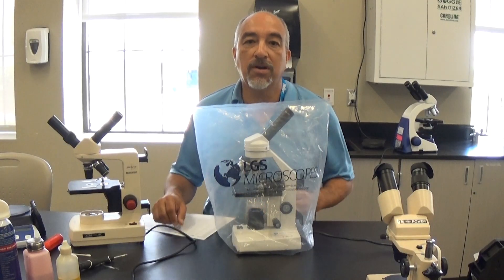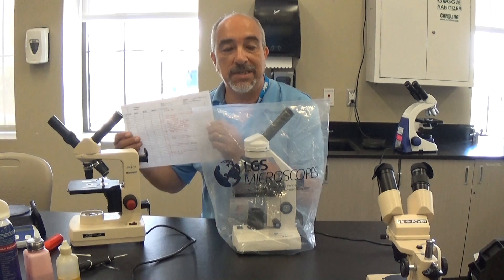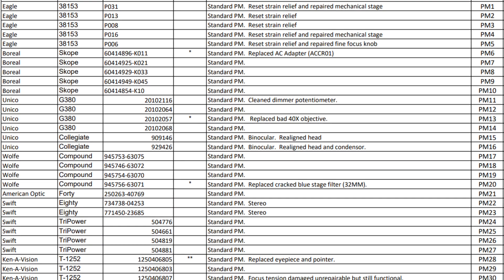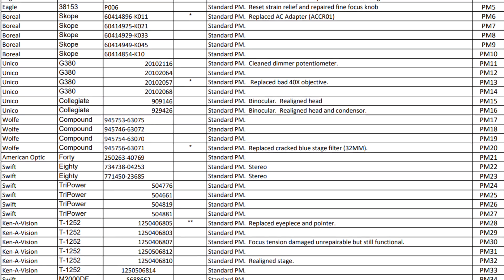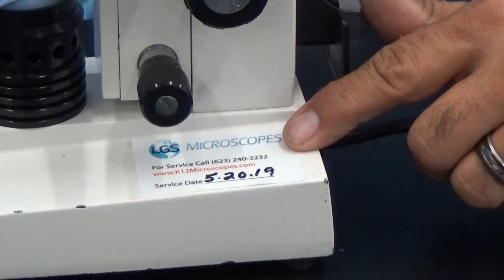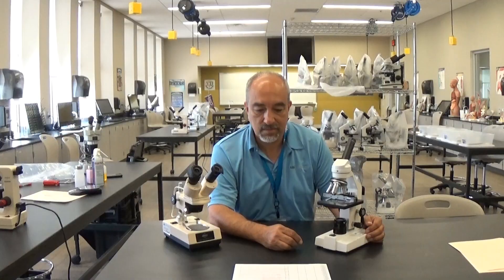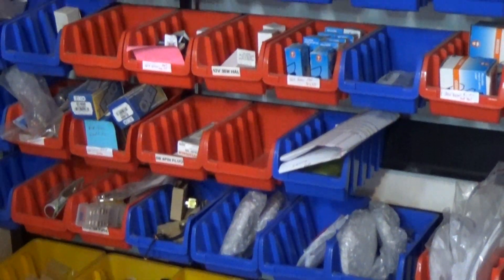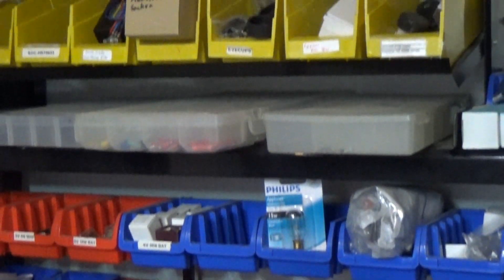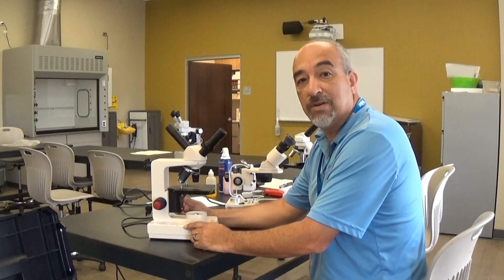We also offer complimentary microscope covers as well as a detailed repair log to include the make, model, serial number, and details of what was done to your microscope. Each individual unit also has a service label so you know when it was last serviced. We stock most parts and bulbs for microscopes. Although we do sell new microscopes, we find that 95% of the time they can be repaired.